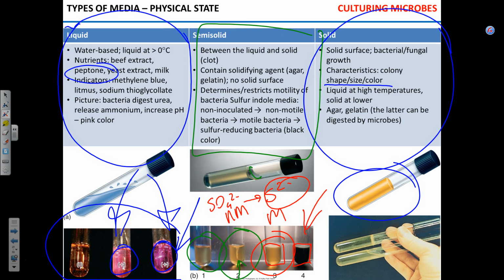When sulfide ion binds to iron, they form iron 2, sulfur 3, iron sulfide. It precipitates immediately. It's not dissolvable in water. It precipitates and it's pitch black.